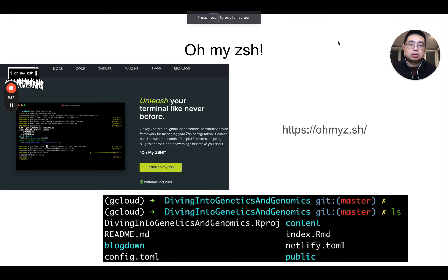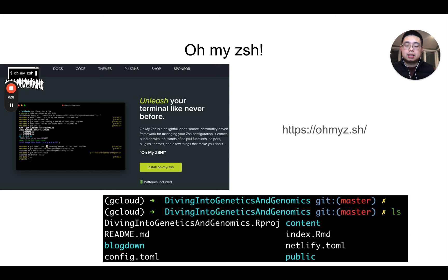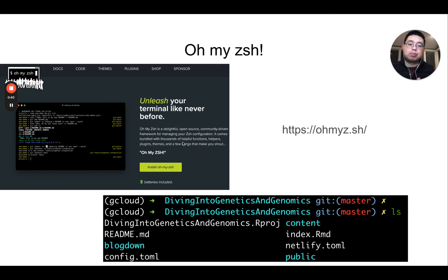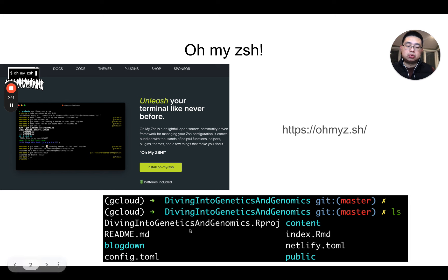The first tool I want to introduce is called Oh My Zsh. Shell comes in different flavors — you can have Zsh or bash. Oh My Zsh is just an open source, community-driven framework to manage your Zsh configuration file. After installing it, you can choose different configurations. For example, you can have colors to highlight the GitHub branches for you.